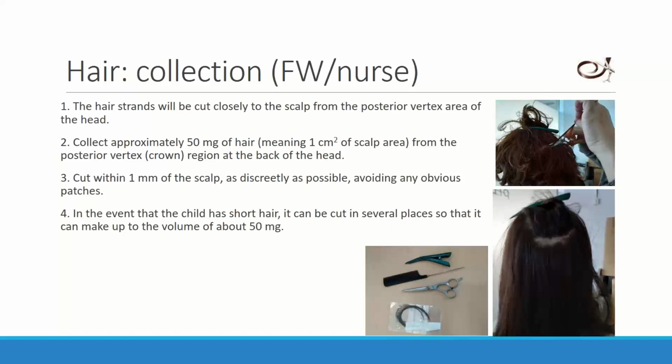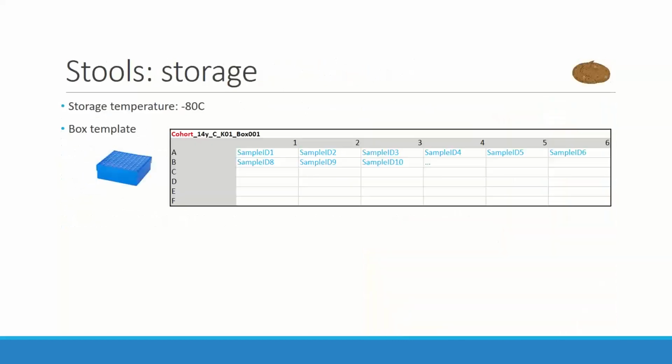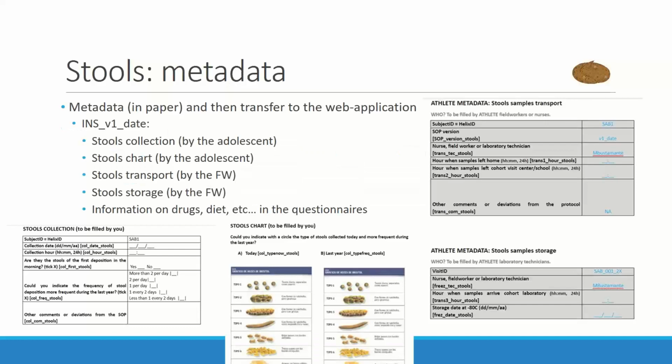Another practical, maybe a little bit strange, question about the stool sample: when you go to the toilet, the kids need to wipe themselves, of course. And where do they throw that paper? You want to avoid them throwing that paper on top of the stool sample. So is it described in the protocol that you put a bin with a plastic bag next to the toilet and put the paper there after you wipe yourself? Do you understand?